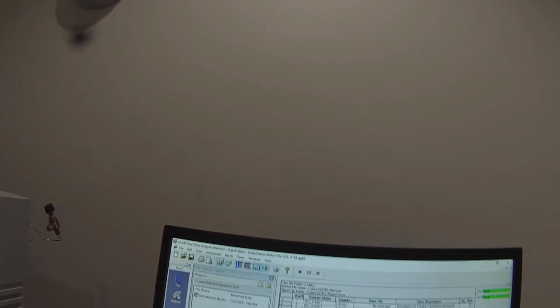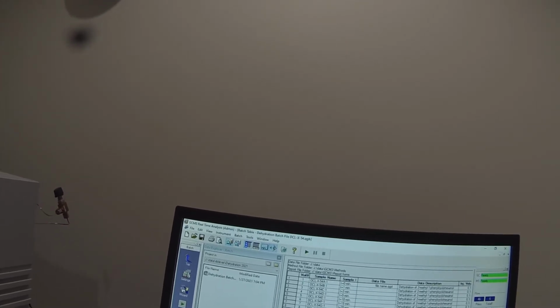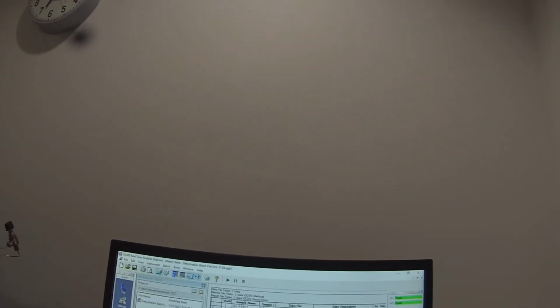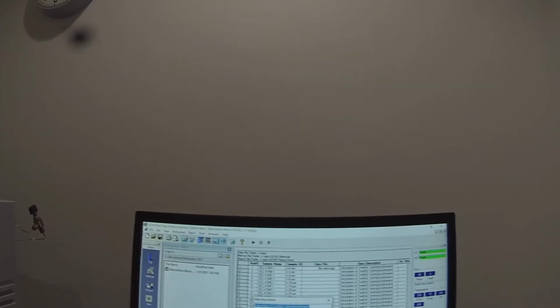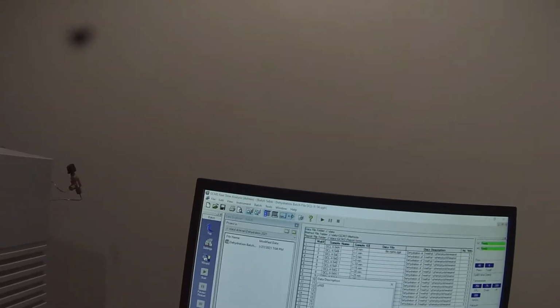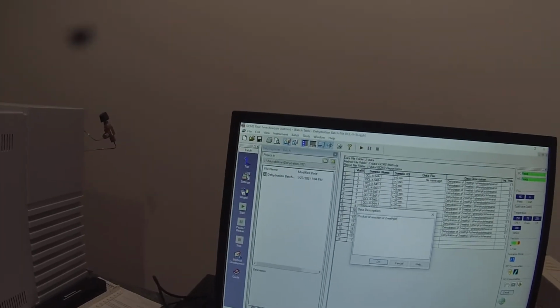So now under sample name, I've got 54A, B, C, D, E, F, G, H, I, J, K, L, M, N, O. I've got 52A-3, which is my crude alcohol, 52B-1, and those are in vials 1 through 17. The data description is going to stay dehydration of 2-methyl-1-phenylcyclohexanol, but down here I will put the data description that says product of reaction of 2-methylcyclohexanone with phenylmagnesium bromide.